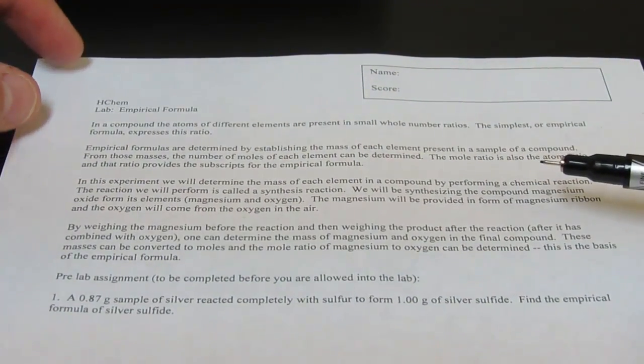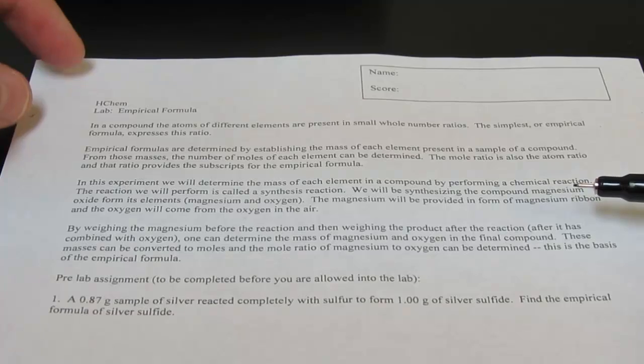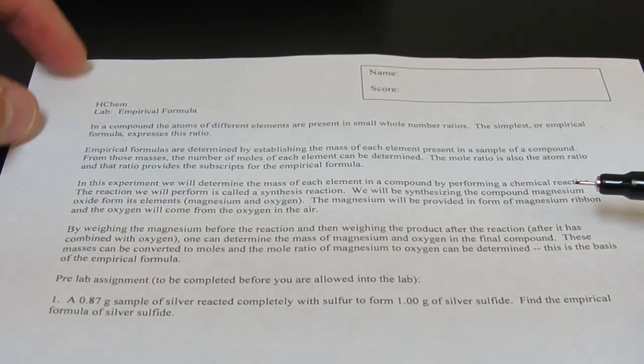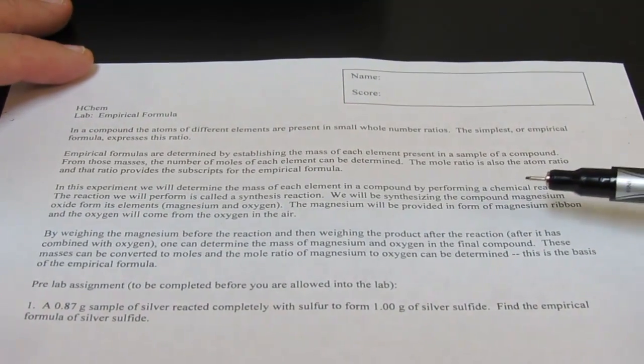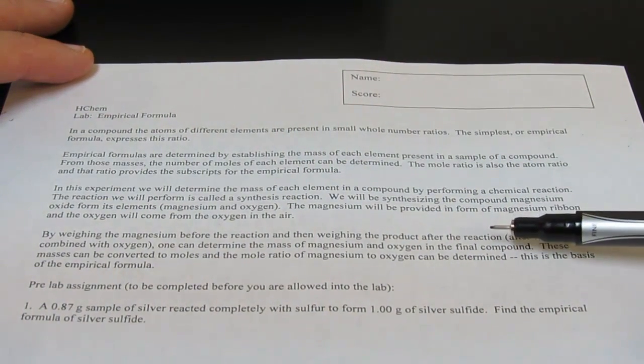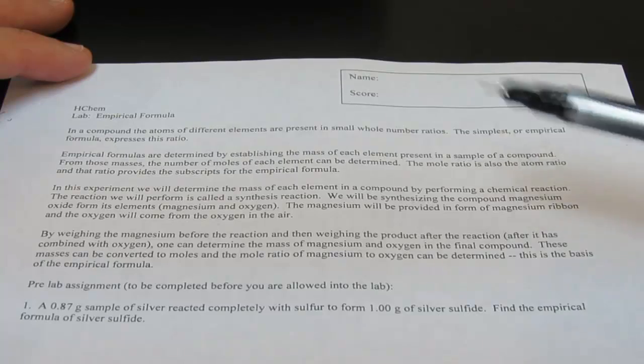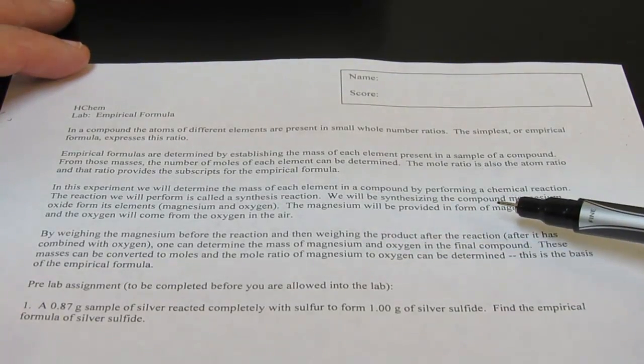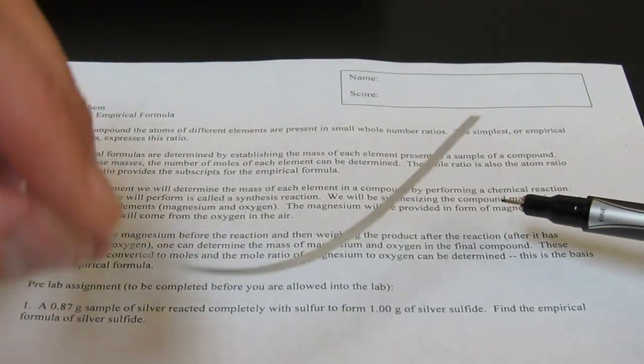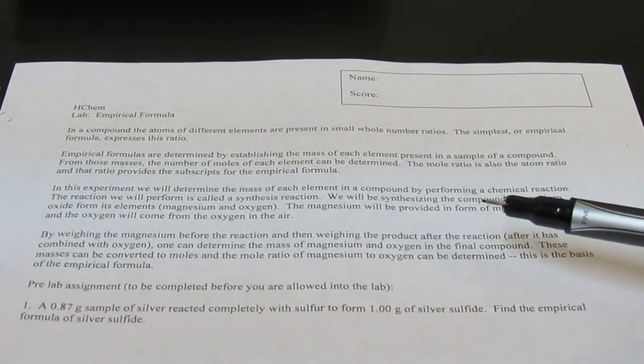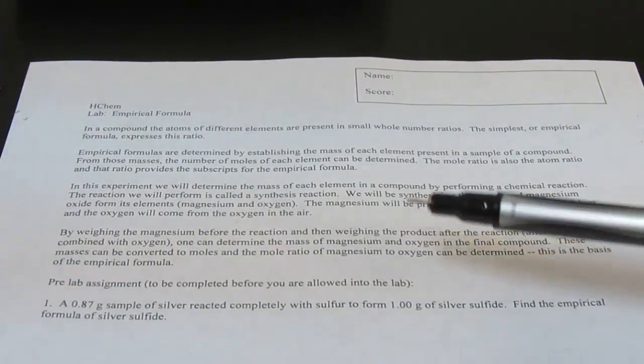In this experiment, we will determine the mass of each element in a compound by performing a chemical reaction. The reaction we perform is called a synthesis reaction. We will be synthesizing the compound magnesium oxide from its elements, of course magnesium and oxygen. The magnesium will be provided in the form of a nice piece of magnesium ribbon, and the oxygen, of course, will come from the air.